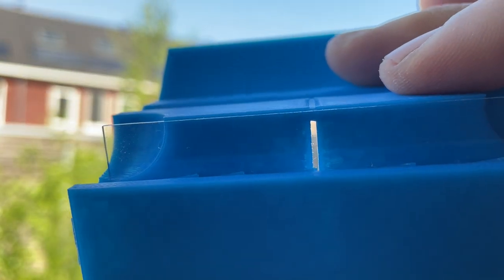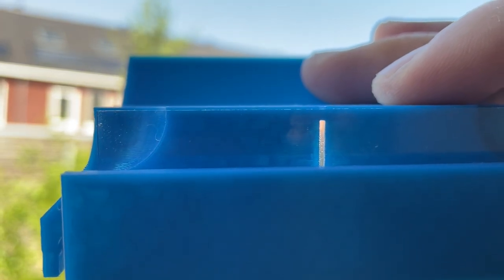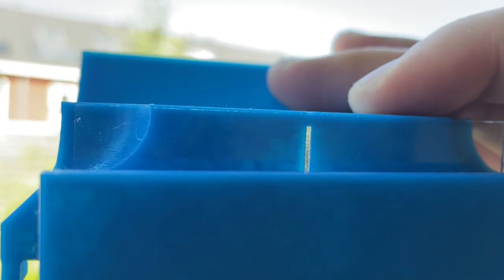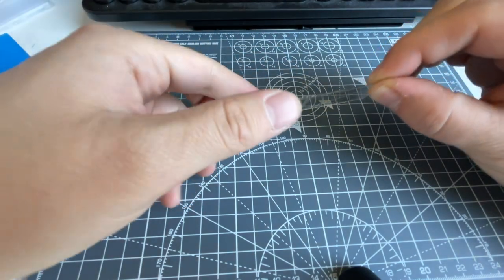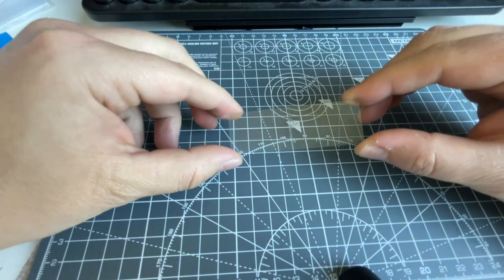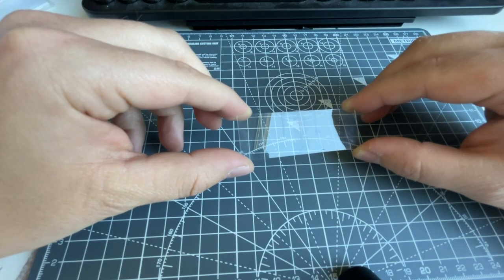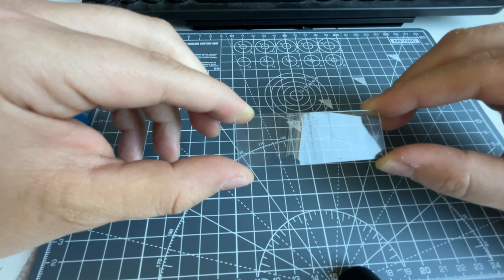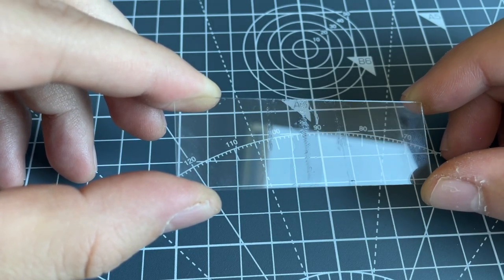After the ride, you can already see the particles by eye. So just put it in front of a light and you can see the particles attached on the glass slide. If you remove the slide, then you can clearly see the lines of particles attached on the glass slide. So pick it up and just look at this beauty. Can you see it?